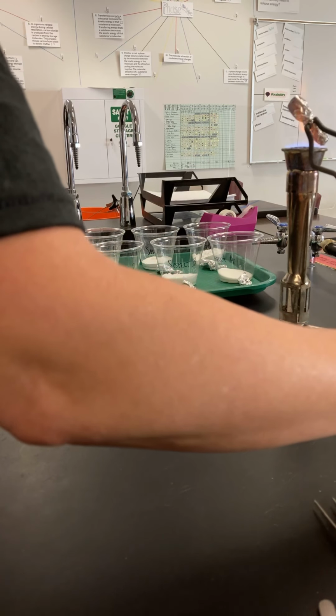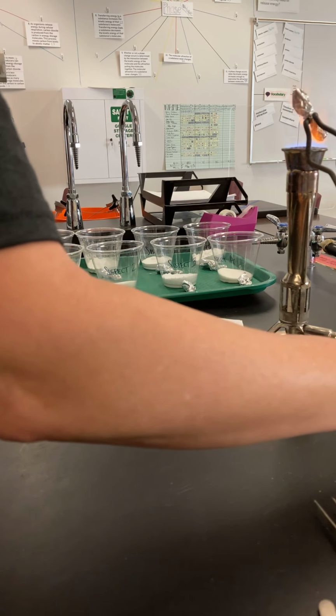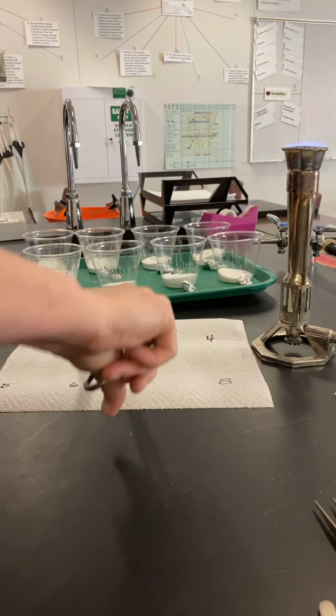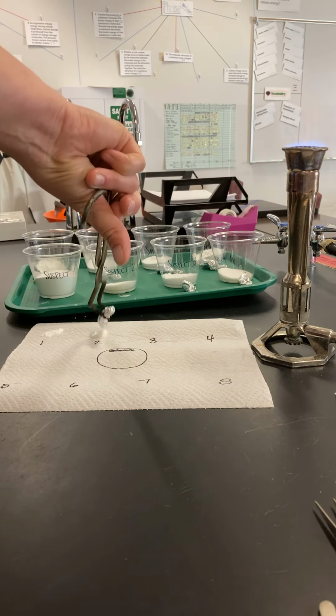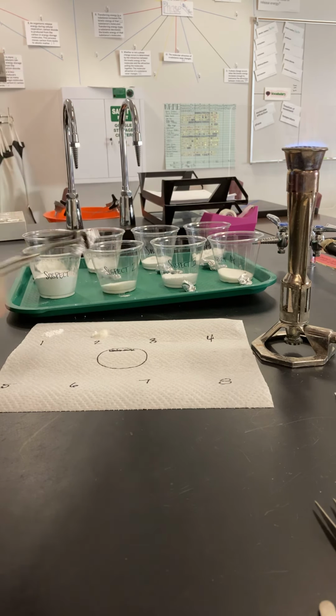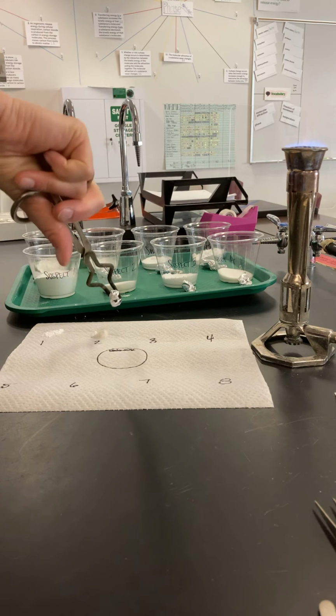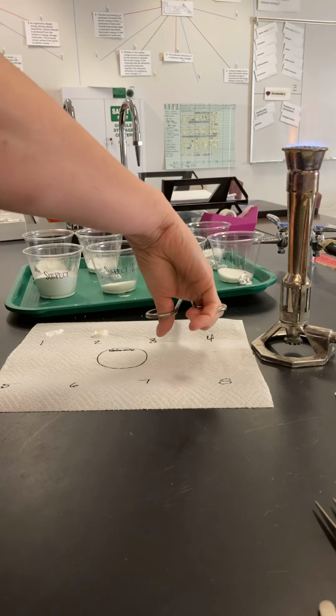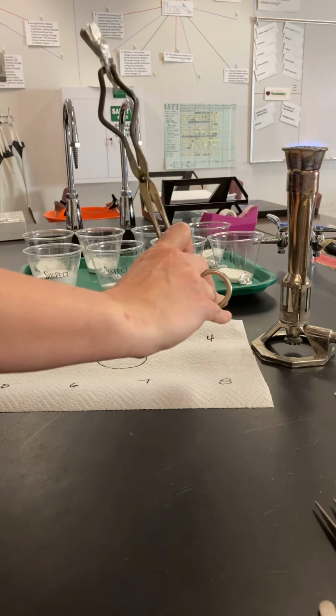1, 2, 3, 4, 5. Okay. Again, if I dump that out, we had a clump. It was a white color. It turned a little bit of a tannish color, like maybe it was burning a little bit. It was, like I said, a really good white color, and now it's a really light tan color or cream color. And then one little chunk formed, but there was no melting. Okay, this is suspect 3.